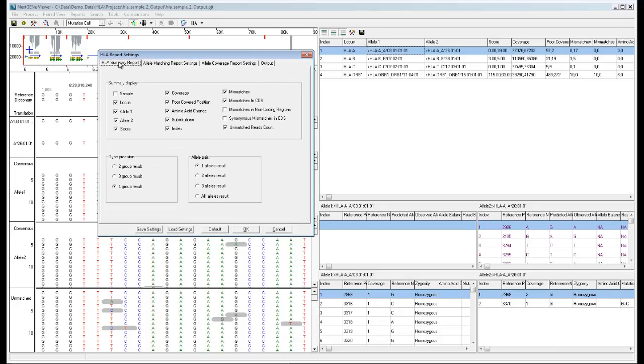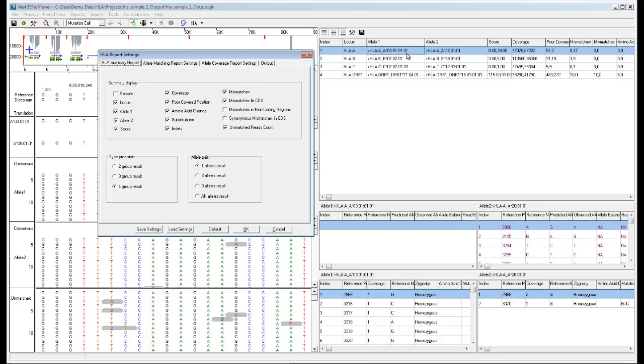On the HLA summary report tab, you can choose which columns to include in the report and specify how alleles are reported. You can choose the level of type precision to be used for reporting alleles. In this example, the four group result is shown. You can see in the allele names, the four different parts of the allele name are shown. The two group or three group option can be selected to show less detail in the allele names.